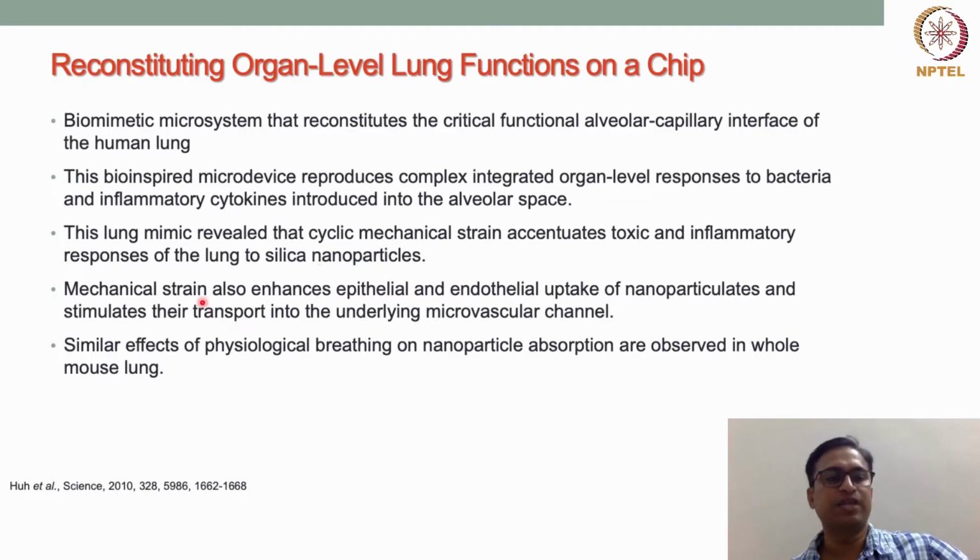The mechanical strain was also used to enhance the epithelial and endothelial uptake of nanoparticles and stimulate their transport to the underlying microvascular channels. They found effects similar to physiological breathing on nanoparticle absorption as observed in whole mouse lung. If a silica nanoparticle is administered to the mouse lung, the similar response could be seen in their devices.